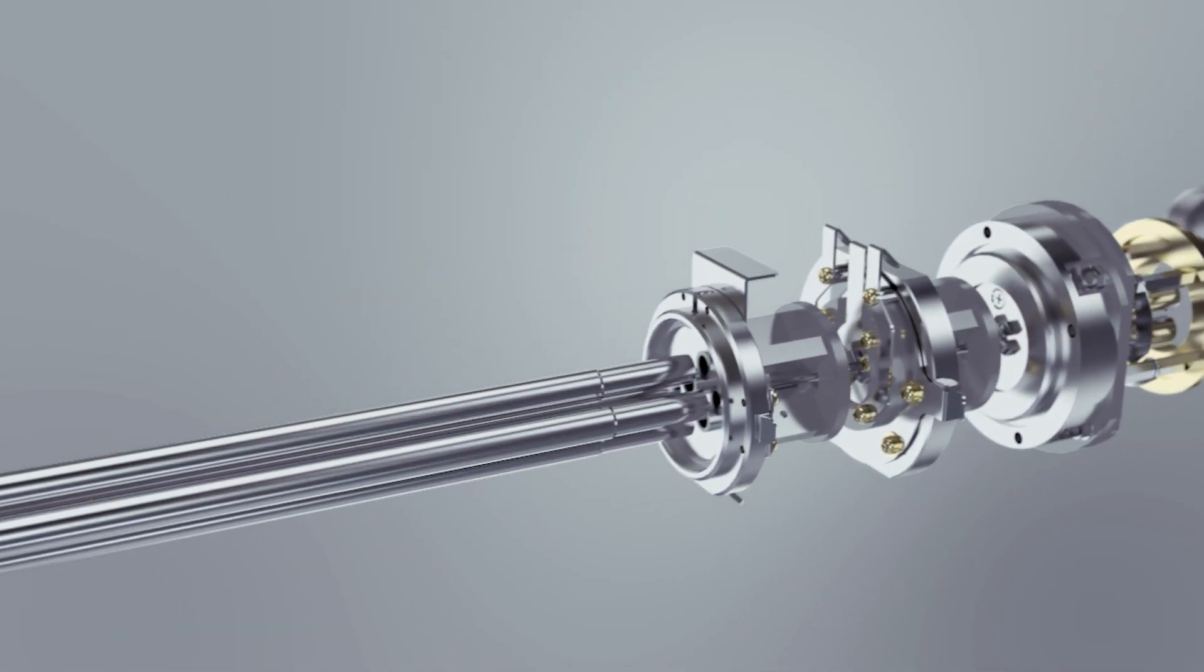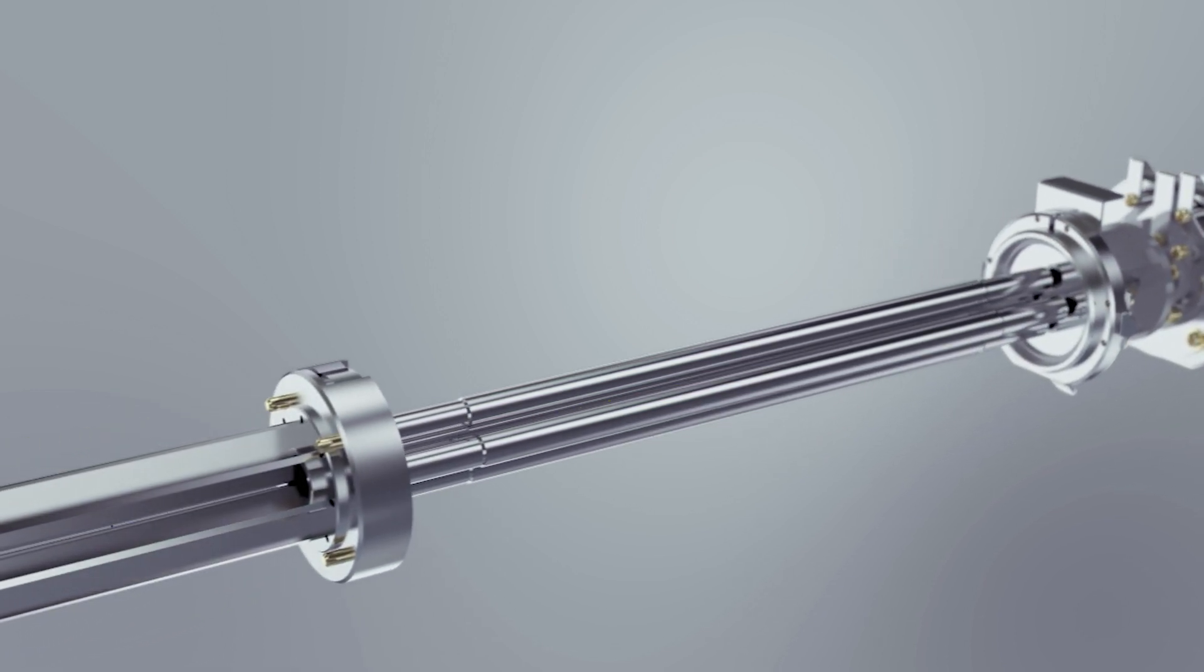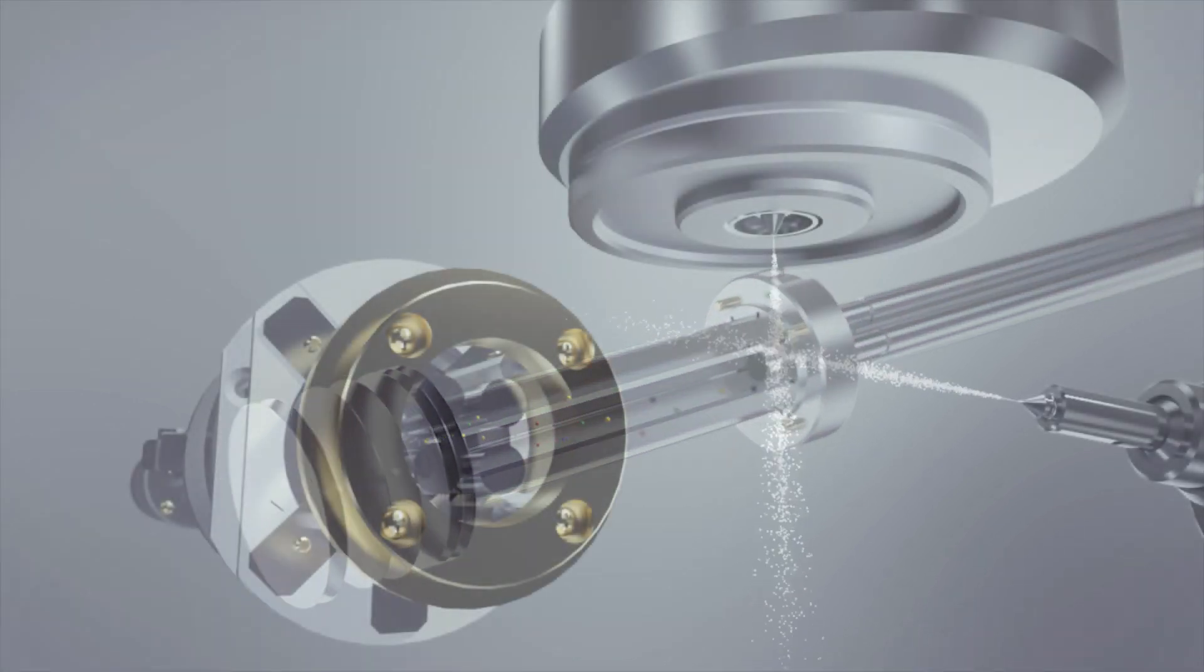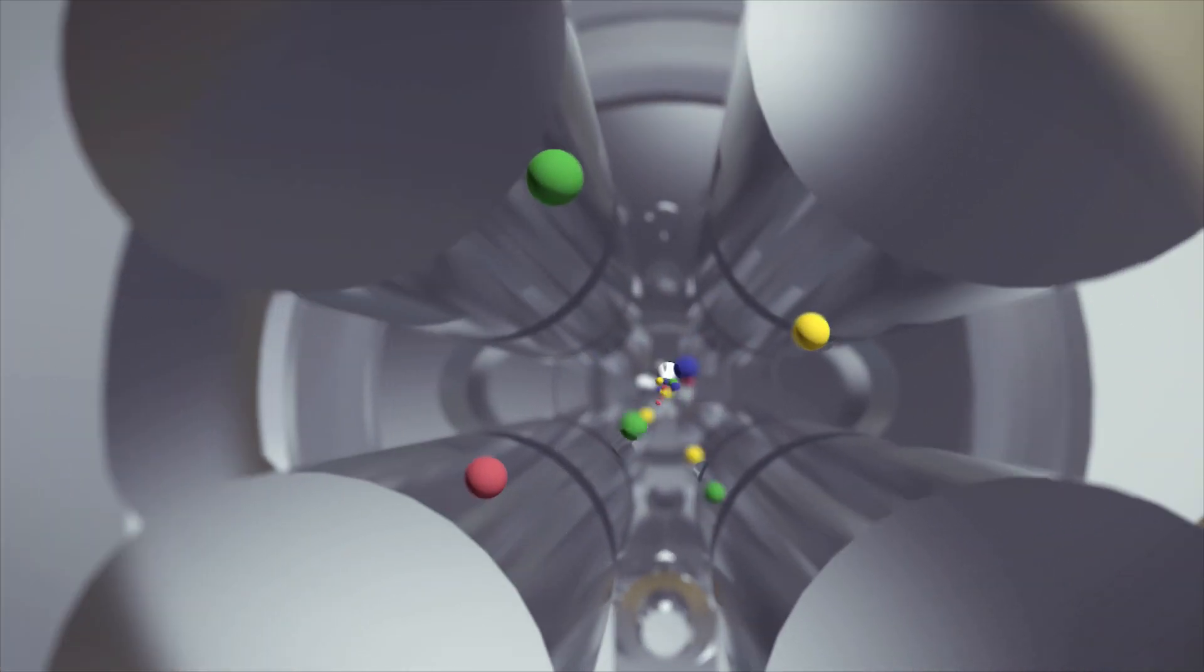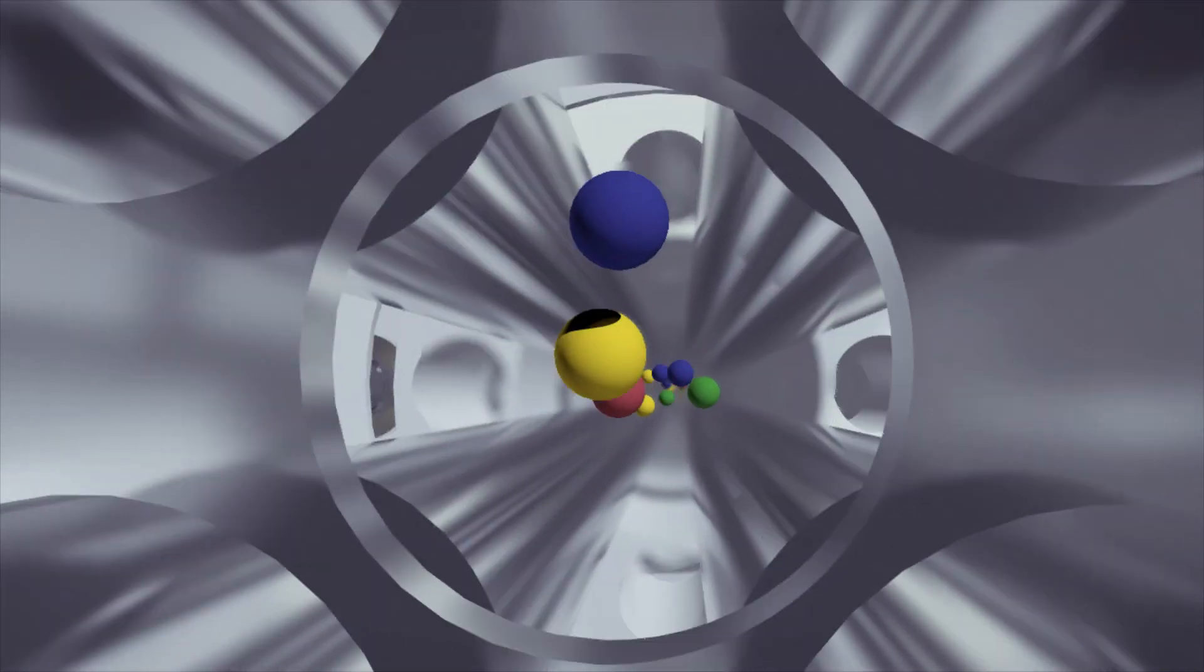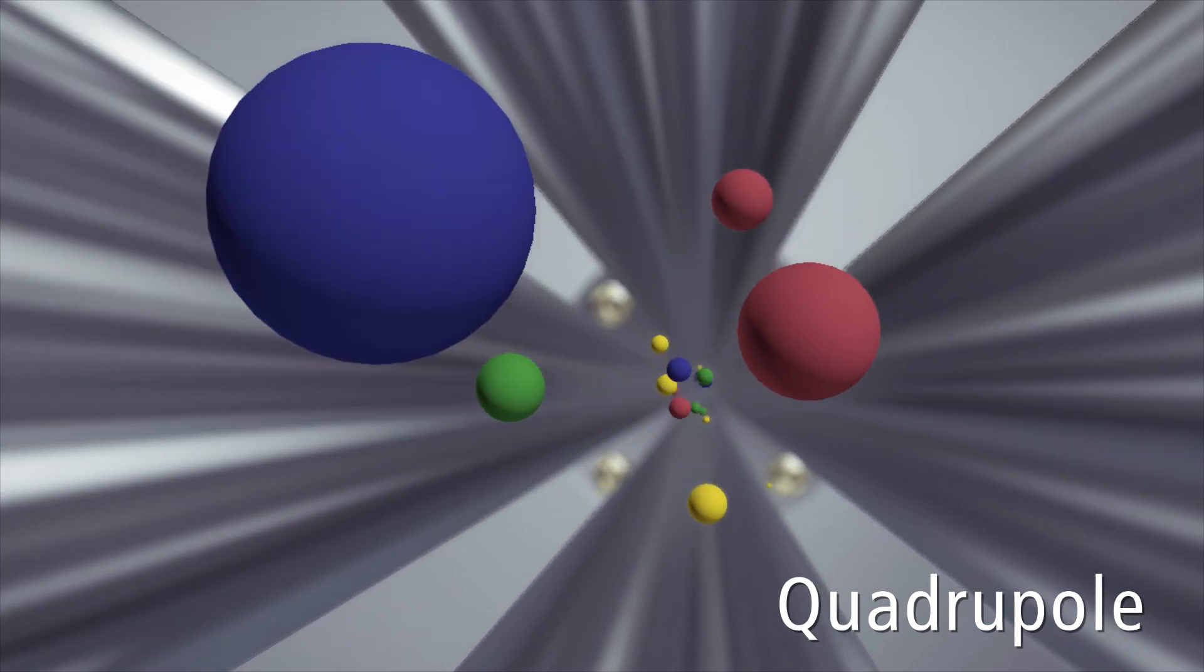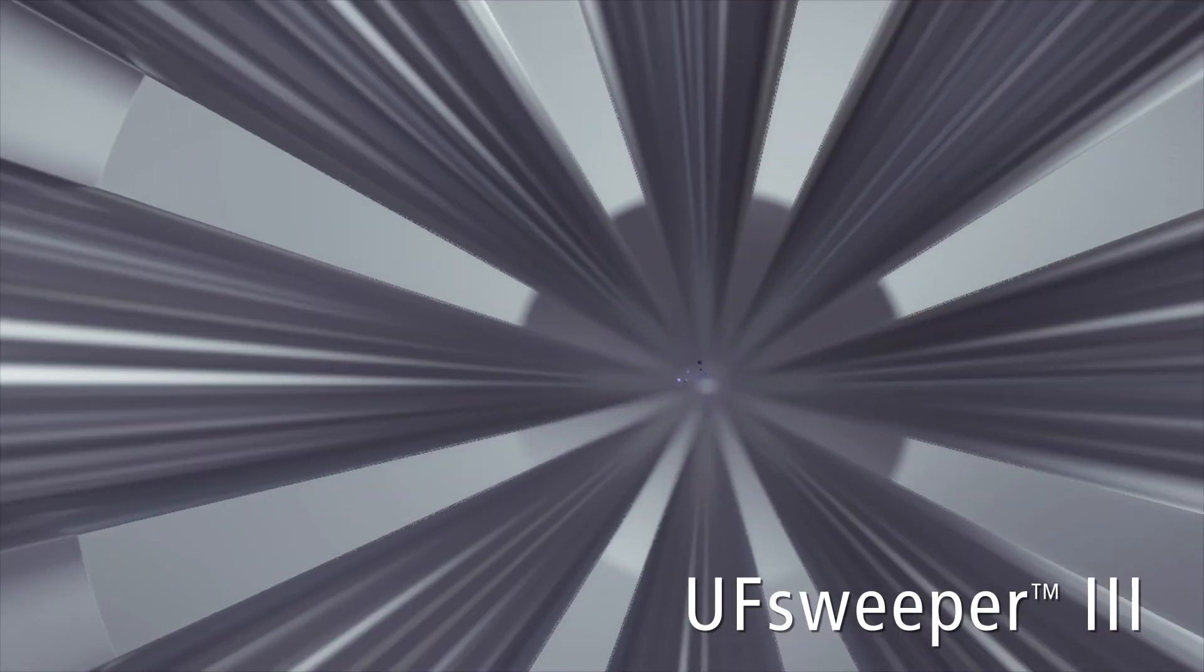The LC-MS 9030 builds on Shimazu's key technologies used in the world's fastest and highest sensitivity triple quadrupole mass spectrometer: the UF-Q array, true hyperbolic quadrupoles, and the UF-Sweeper 3.